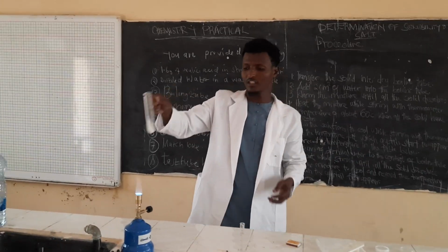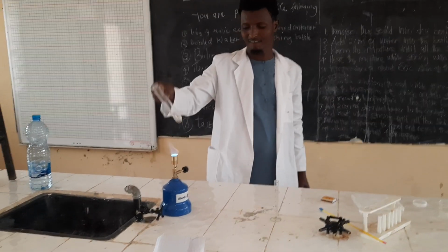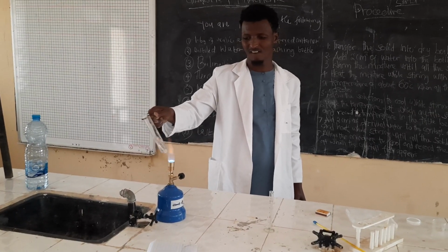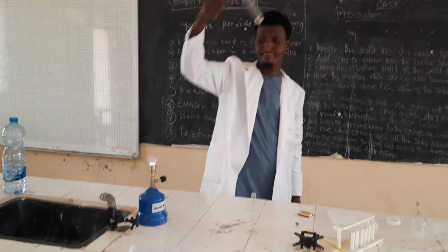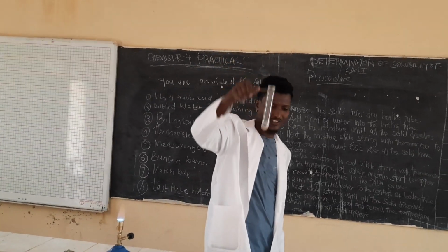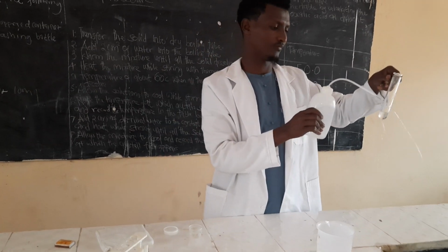Then I will allow it to warm so that all the solid will dissolve. Yes, all the solid has dissolved. Now I will allow it to cool.